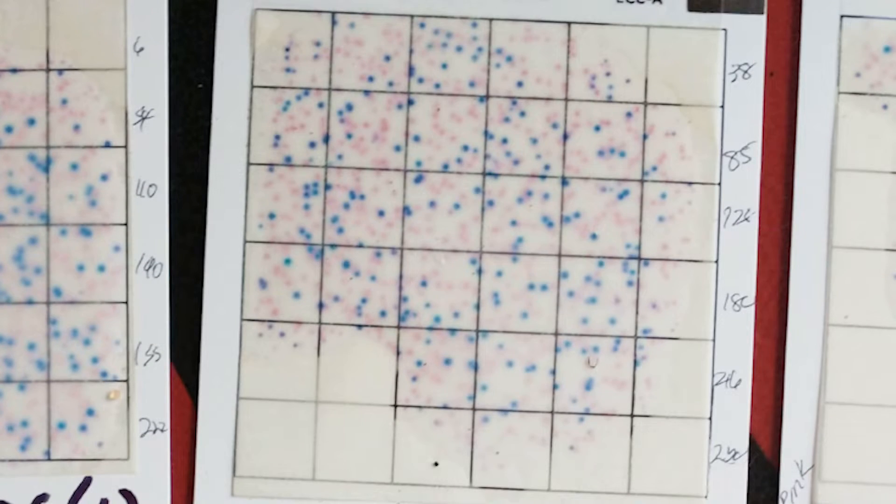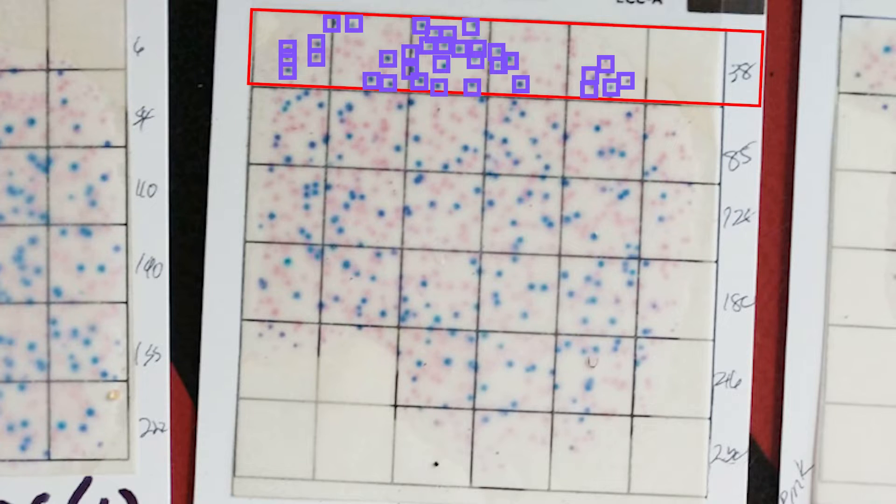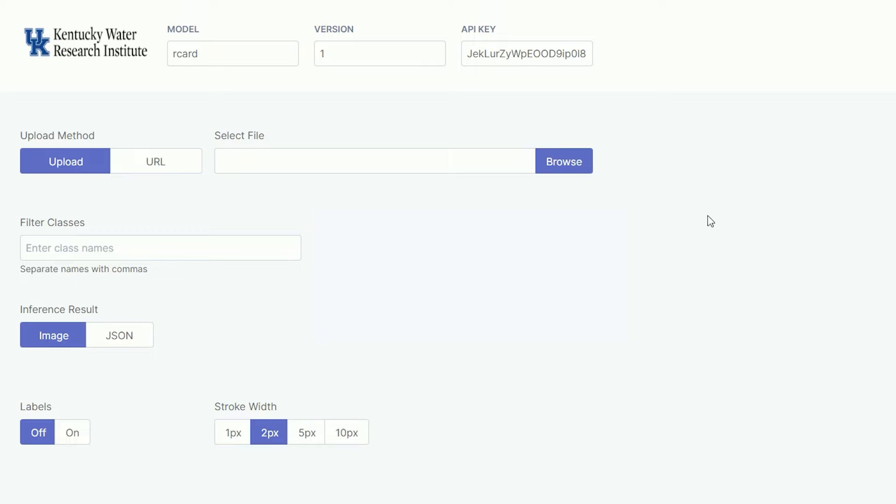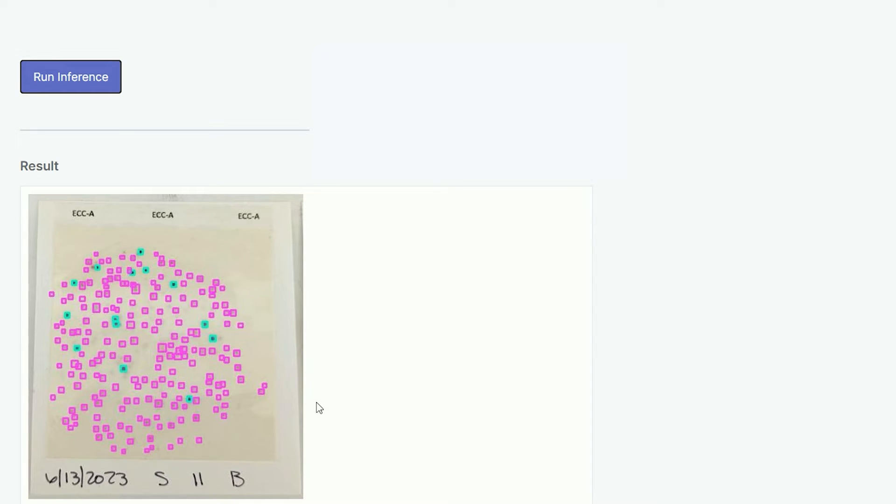In instances where the colonies are numerous, you'll want to employ techniques to make enumeration more efficient and accurate. For example, use a row or column counting method to count all of the cells for a particular row or column and record the total on the side of the card. Then, when all the cells have been counted, sum the totals to get the E. coli concentration. As an alternative, the Kentucky Water Research Institute has developed a model to count the distinct colonies on the R-cards and will soon release a mobile application. The application allows you to upload photos of your R-cards and generate a report with the counts and averages. Please take photos of your cards so they can be used for verification and as training data to improve the model.